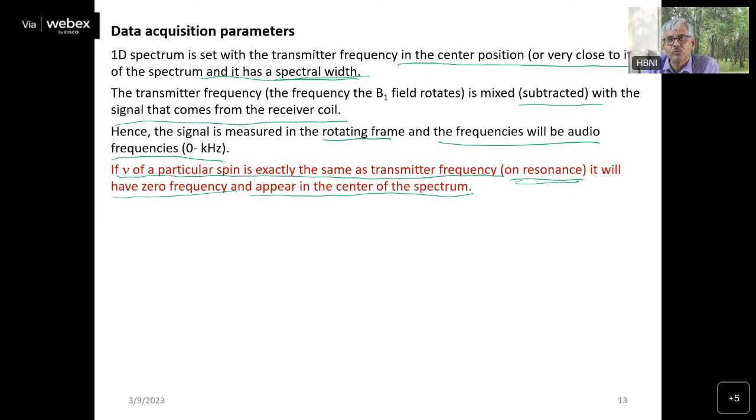So this is your reference frequency. Now with respect to your reference in NMR, it will have a particular delta value or frequency value. So don't get that confused, again I am telling you. This is with respect to the recording or operation of the NMR instrument, but that referencing is done afterwards.